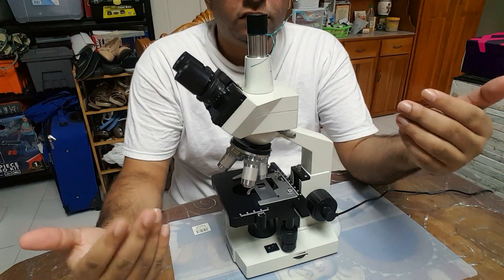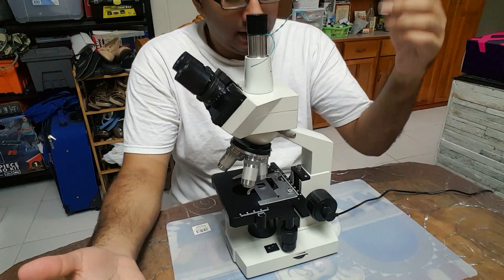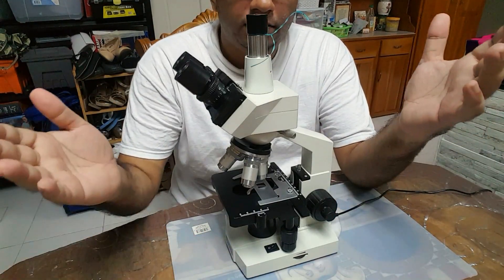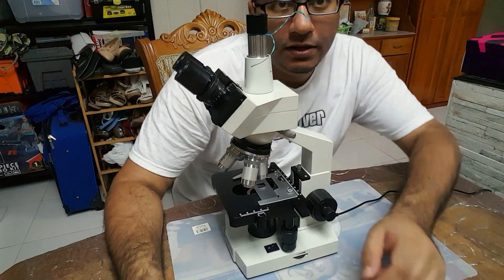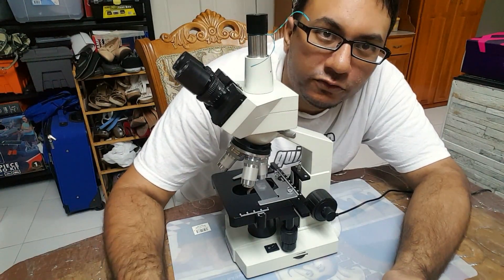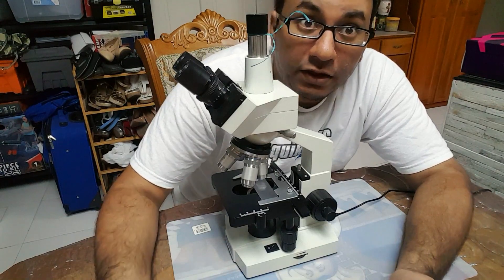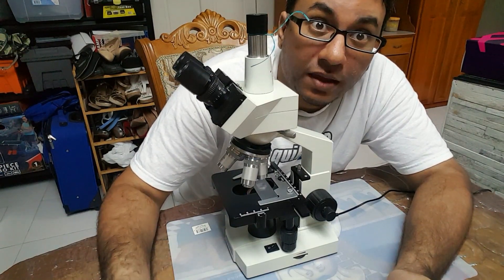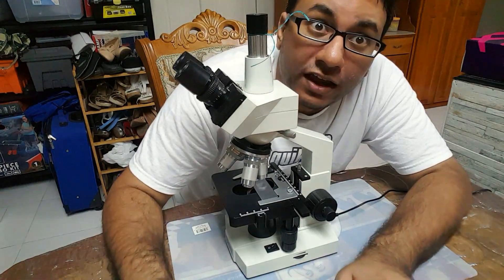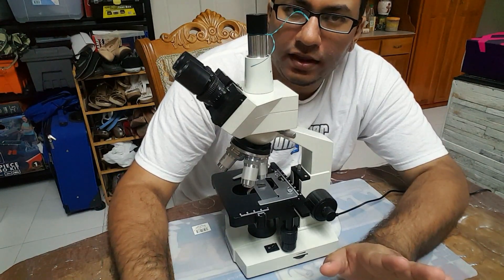We're back and this is the OMAX 40x to 2500x microscope available on Amazon. This cord is just to power it on. I'm going to do a quick review of things I've learned from it. I bought this microscope because I wanted to see cellular organisms in water. It was advertised as magnifying 40x up to 2500x, but I want to tell you upfront — this doesn't do a good job at 2500x, and I'll get to that explanation in a bit.